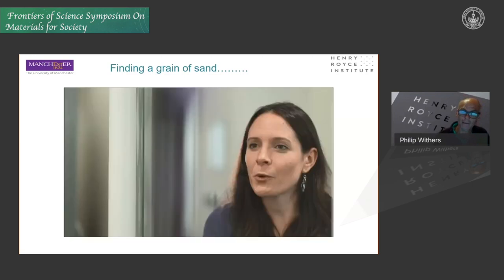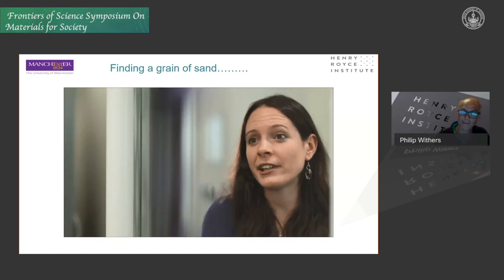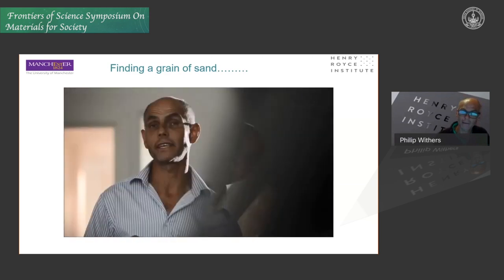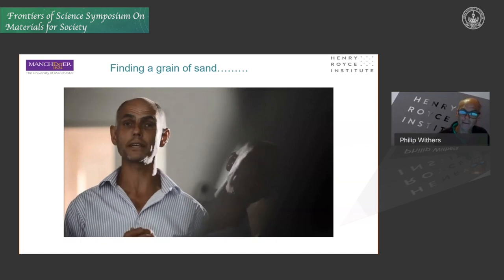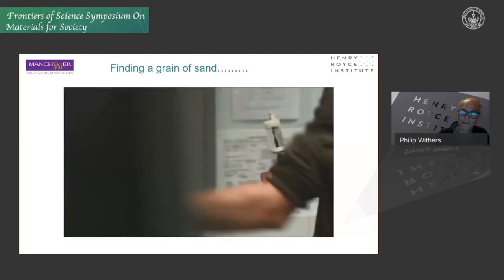And we're also able to analyse at a very local level, just at the nanoscale, the types of elements that might be segregated or depleted along that grain boundary. So we have seen how you can forensically peel away the different length scales to better understand the corrosion that takes place in the materials of today, and provide a basis for a whole new breed of materials for tomorrow.